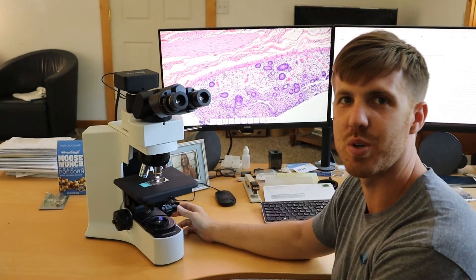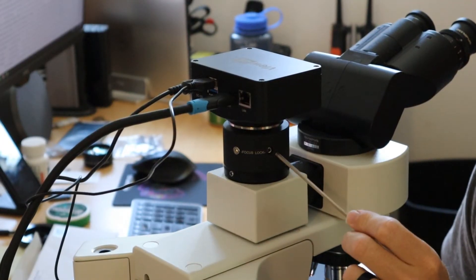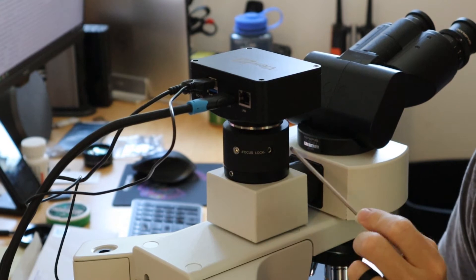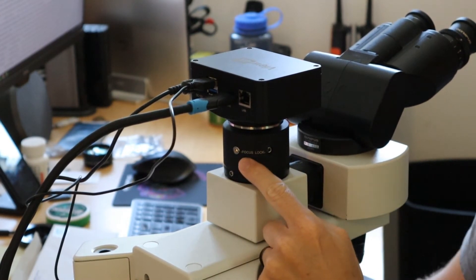Once it's in focus, we can get started focusing the camera. There are two screws on most adapters — most C-mount adapters. There's going to be a lock screw and there's going to be a focus screw marked 'focus'.